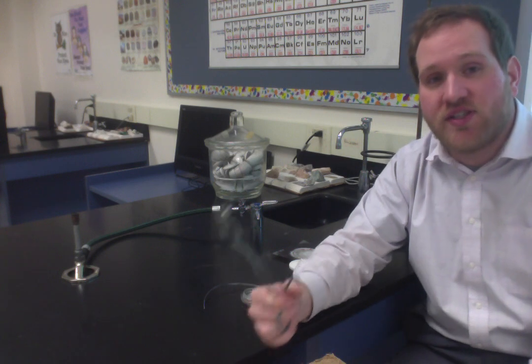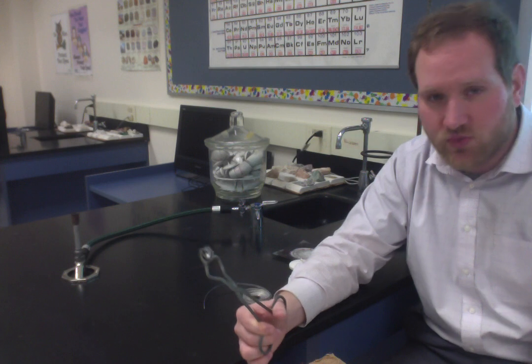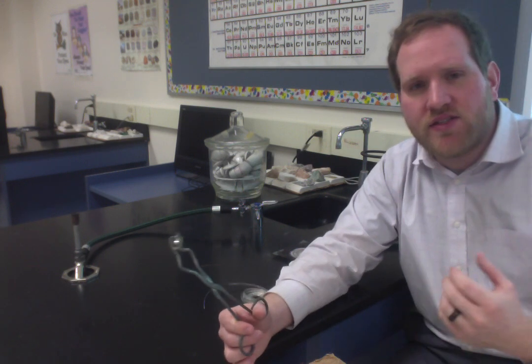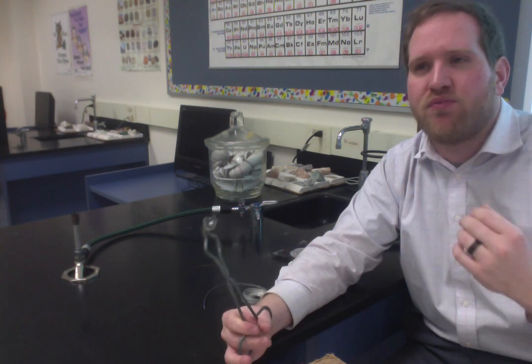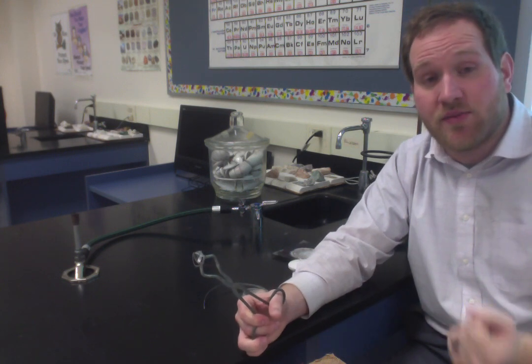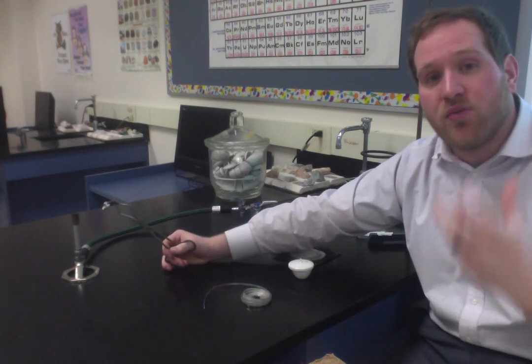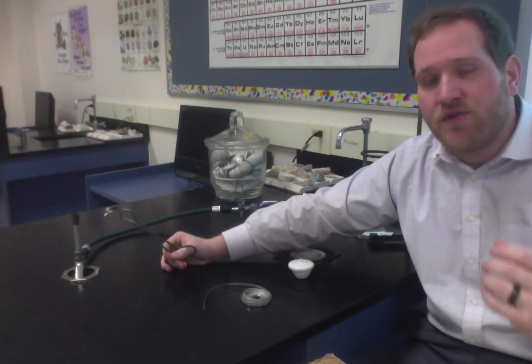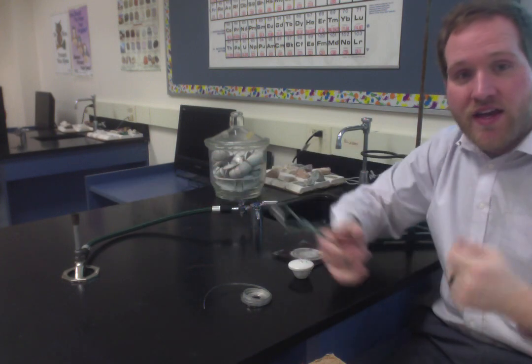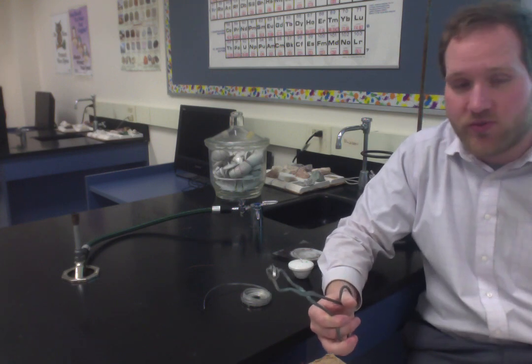It also produces an extremely bright white light, very dangerous to look at, and your teacher will certainly warn you about this. And the third reason is you wouldn't just be producing magnesium oxide. You see, when we burn this in a controlled way, it's going to react with oxygen. But if you just let it ride, if you just burn that thing, it's going to actually bond with the other gases in the air, the most common gas in the air, which is nitrogen.